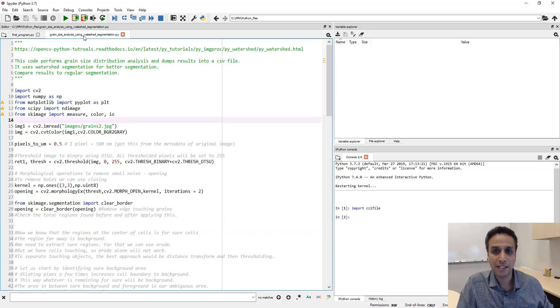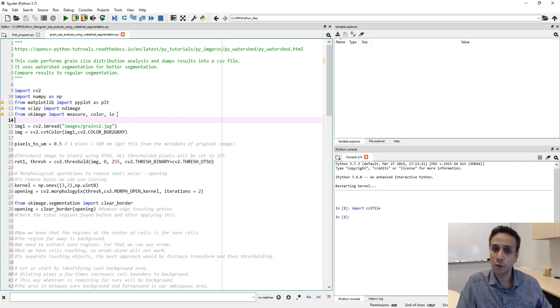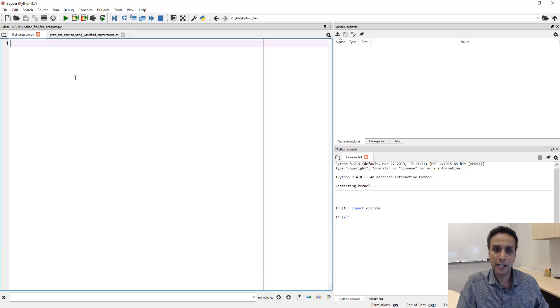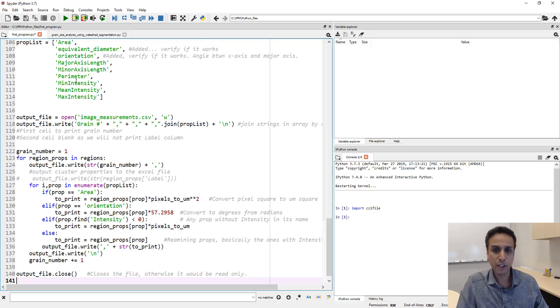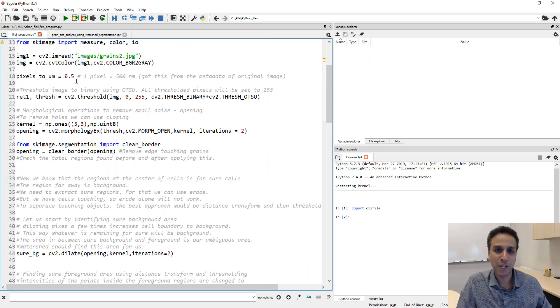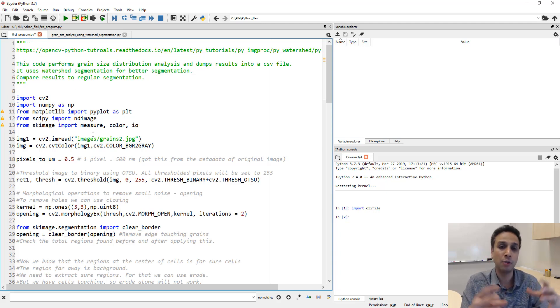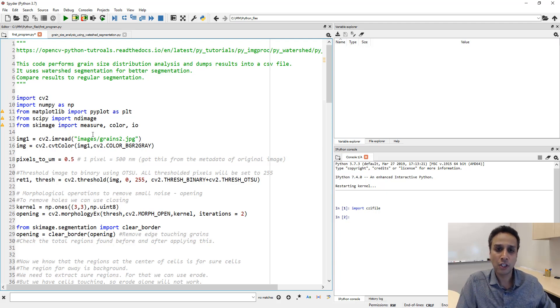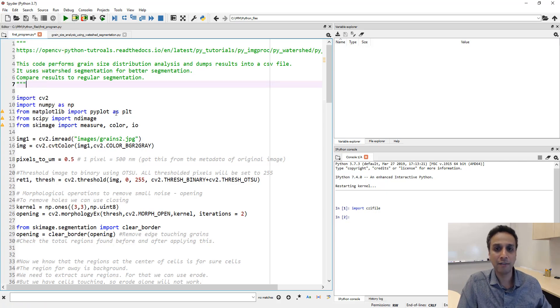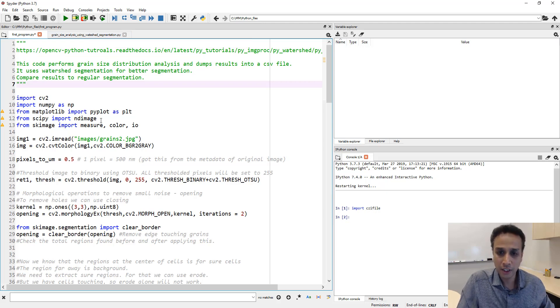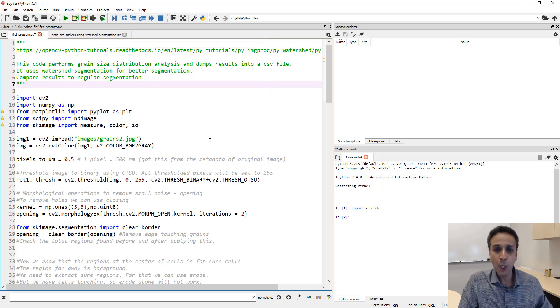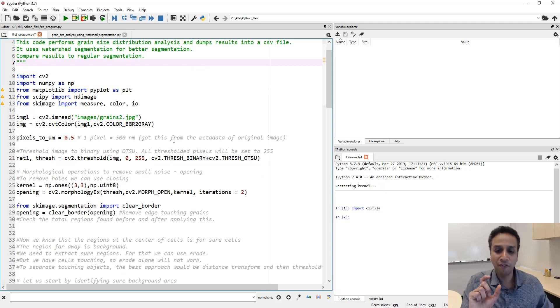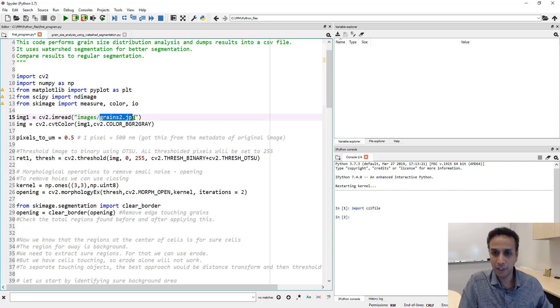Now let's look at this code. This is the grain size analysis using watershed code that we developed in our previous tutorial. Let's take this code and paste it into a temporary file. Once it looks good I just do file save copy as and give it a proper name. This is the way I work. Let's go ahead and edit this code to fit our cell image. First of all this file name here is called osteosarcoma.tif.